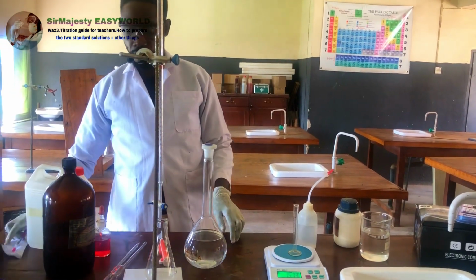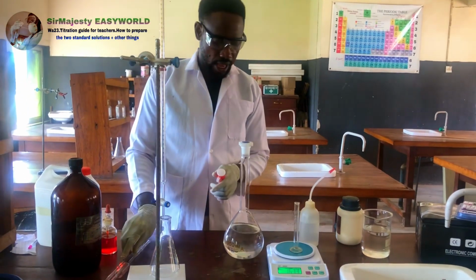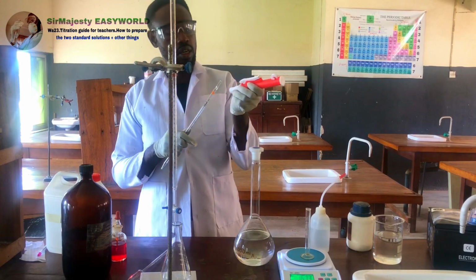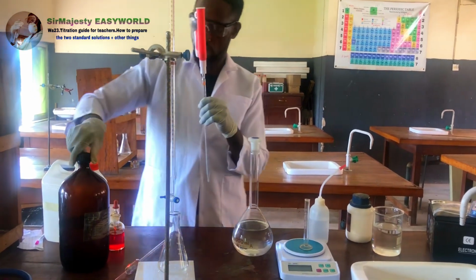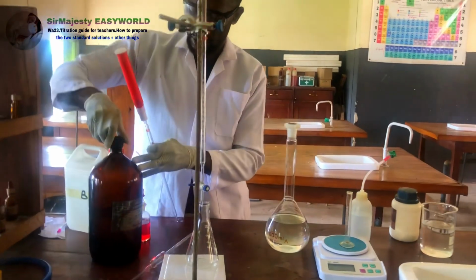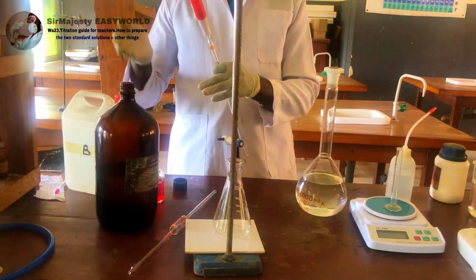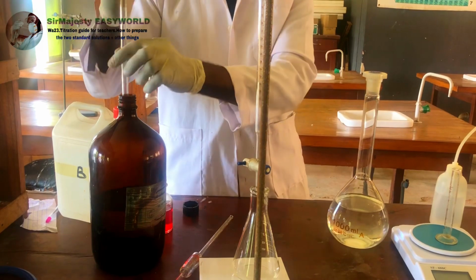Remember, it's in gram. What I will do next is add a known volume of the raw acid, undiluted. This is the stock acid, the concentrate. I want to know the SG, and you can see it is a fuming acid. I hope the camera can get those fumes, and that makes it very sensitive to the environment.